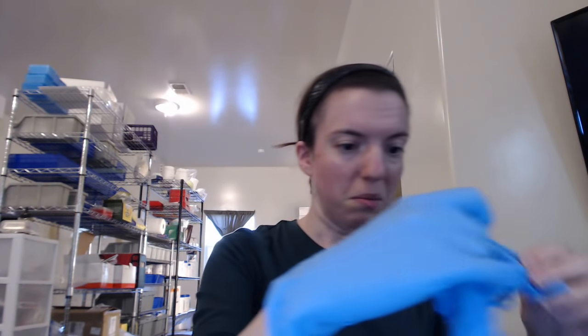Hi everyone. Today we're going to be going over using our scales and pipettes. First things first is safety — if you have long hair you're going to want to put it up, because hair and plasmid is worse than hair and food. Next, since we're doing science, we want to put on our gloves. You don't really need eye protection or a mask for this, but gloves are great.